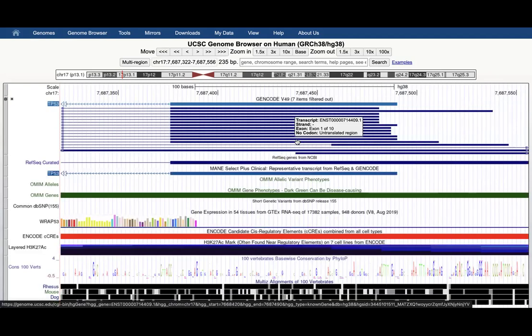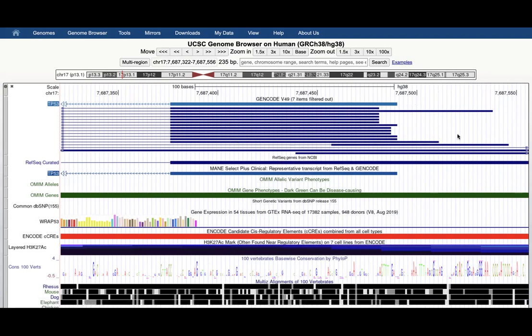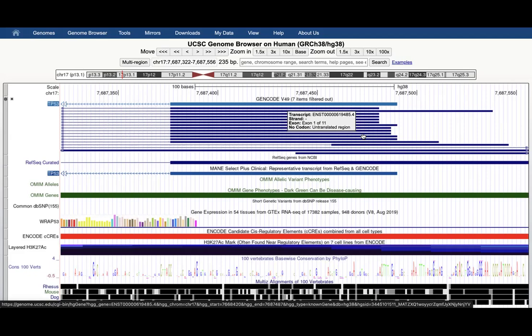Alrighty, so now I'll show you how to add some basic annotations from the tracks that are readily available to us. I'll use the visualization of CpG islands to show how methylation patterns can be predicted using UCSC. And I chose CpG islands because they're usually located near the promoter region of a gene, which is this area, probably a little bit upstream of it, which is over here. And they are typically unmethylated in actively expressed genes.